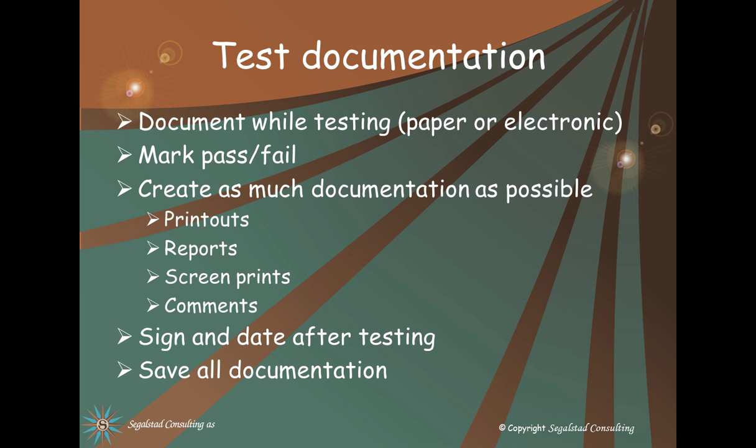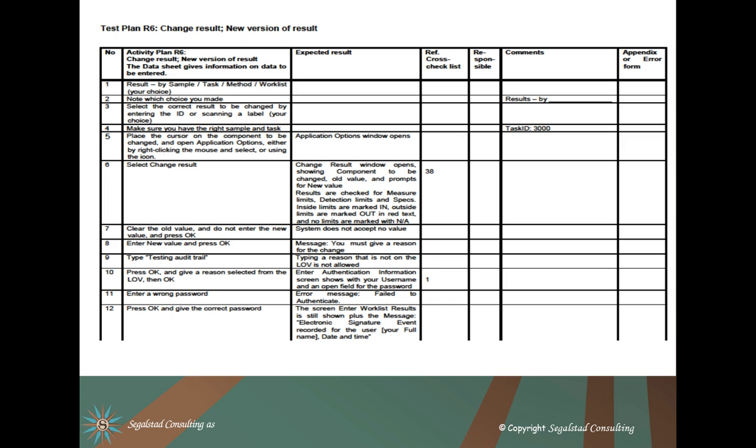The test documentation. We will document while we are testing. It could be done paper or electronically. We'll mark pass and fail while we are testing. And also we will create as much documentation as possible. It could be printouts, reports, screen prints, comments, and we will sign and date after testing and of course save all the documentation.